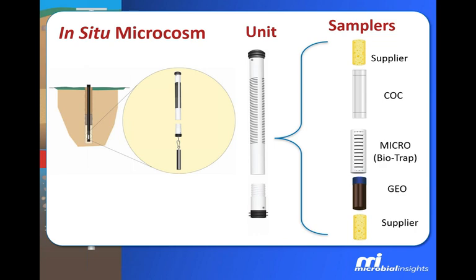It is packed with about 250 bioset beads. This is the standard design that's used in groundwater sampling, but we've also buried them in soil, buried them in sediments, any kind of environment you can imagine. We can place that particular trap.